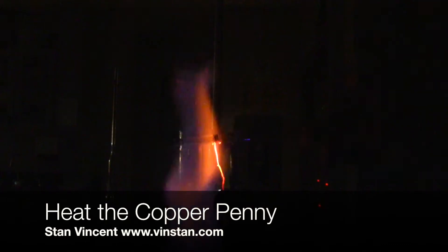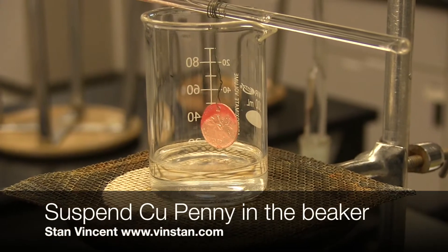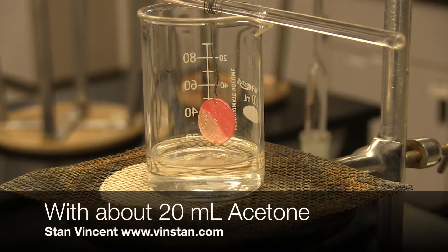Now heat the copper penny using the Bunsen burner until it is red hot. Turn the Bunsen burner off. Suspend the red hot copper penny in the beaker with acetone.